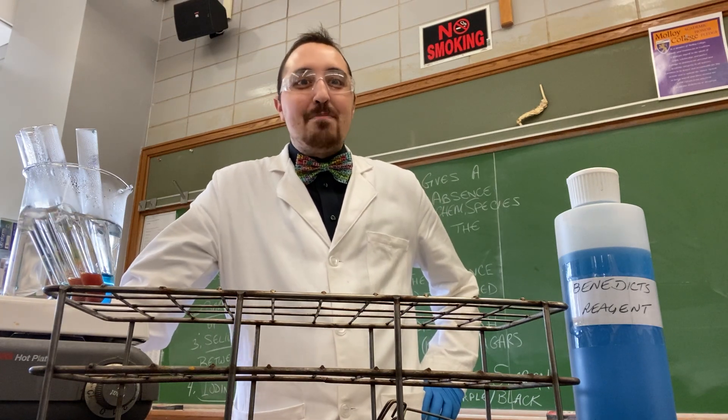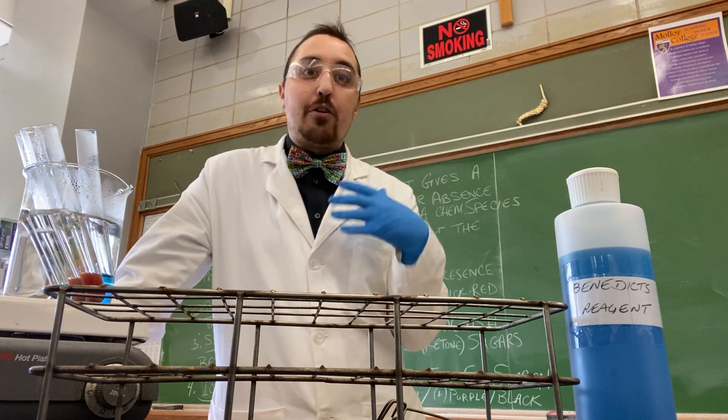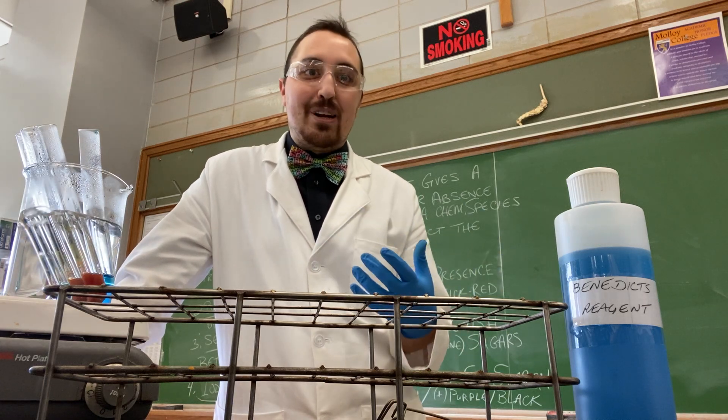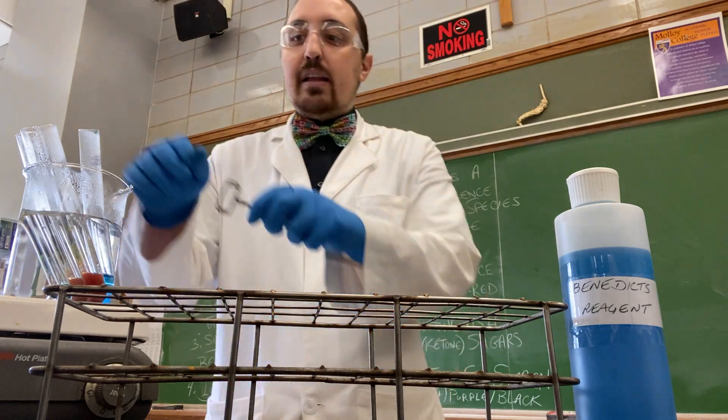It's been five minutes and we have Benedict's solution inside our six test tubes. Remember, we have water as a control and five carbohydrates. They've been in the water bath for about five minutes, so let's check out the results.